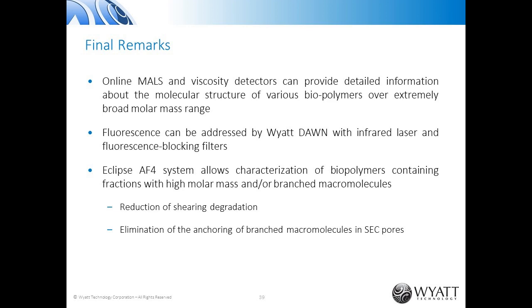Great. One last quick question. How would you recommend monitoring reactions such as polymerization or depolymerization? Yeah, so I would recommend SEC in combination with multi-angle light scattering. It can be done very quickly. You can also use now APC columns that allow separation of a polymer sample in just a few minutes. And also Wyatt Technology offers detectors for APC. And then you can get information about the molar mass distribution in just a few minutes, and it is well suited to monitor the polymerization reaction.